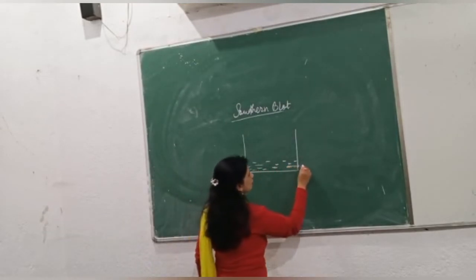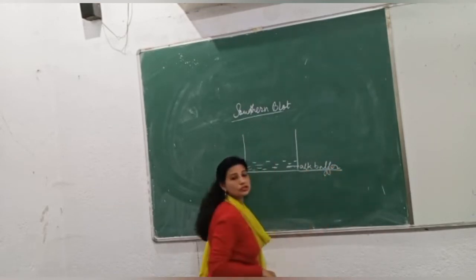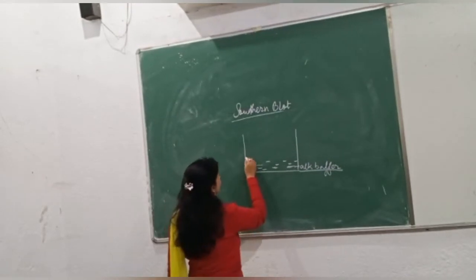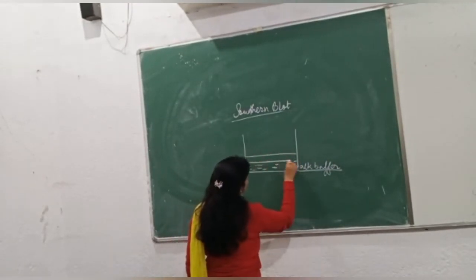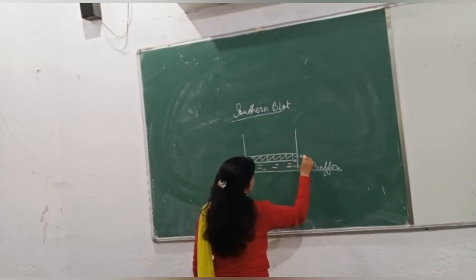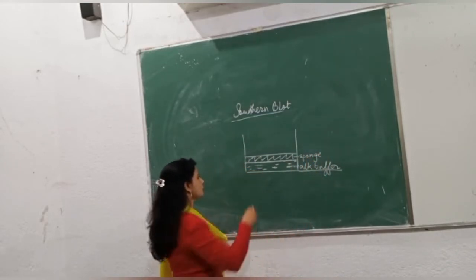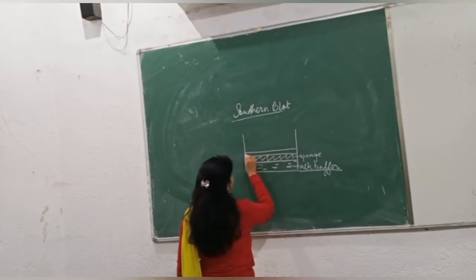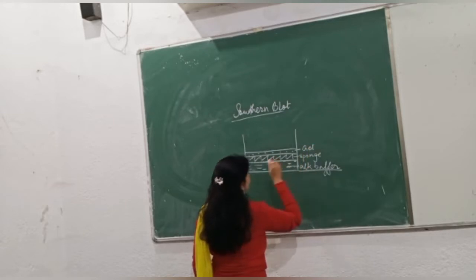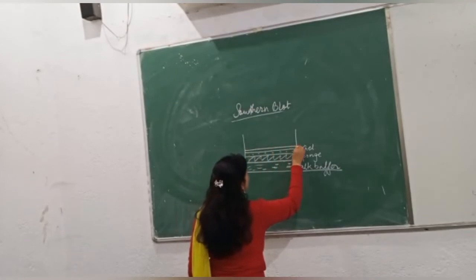This is the alkaline buffer that I have used. We need buffer solution so that the pH of the whole content can be maintained. So, alkaline buffer solution. On top of the buffer solution, I apply some sponge so that it soaks in the wetting nature. And on top of the sponge comes my agarose gel. Again that gel, what gel have we used? It's agarose gel. On top of this gel comes the nitrocellulose membrane.